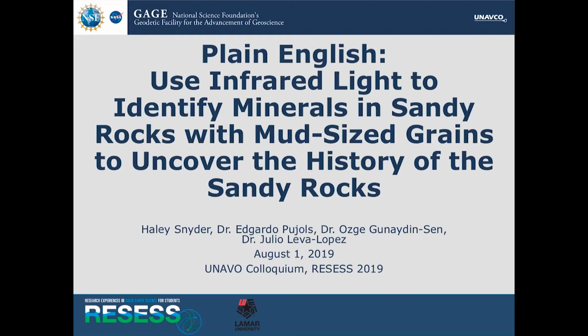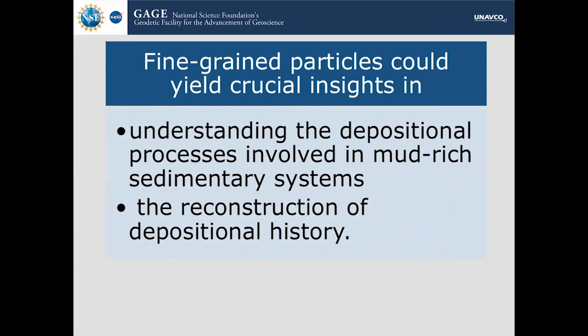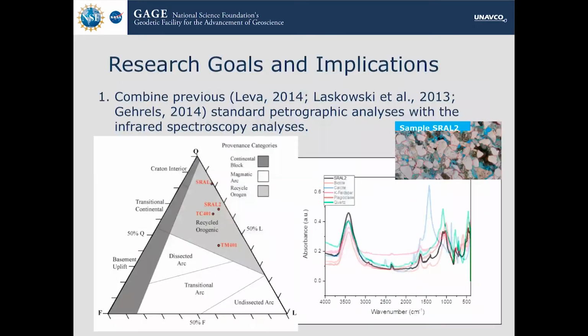Yes, much better. So basically the motivation for our study was to use fine-grained particles because they can yield crucial insights into understanding the depositional processes involved in mud-rich sedimentary systems and also reconstruct the depositional history of those rocks. So our goals were to combine the previous sandstone petrographic analysis with FTIR, or infrared spectroscopy analysis. FTIR means Fourier transform infrared spectroscopy. There you go. That's a big word, I know.